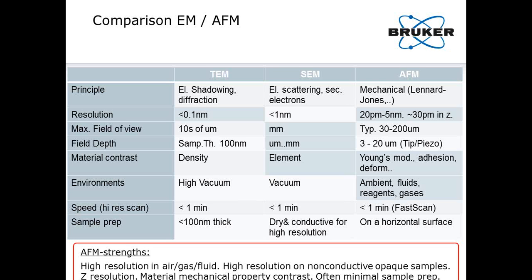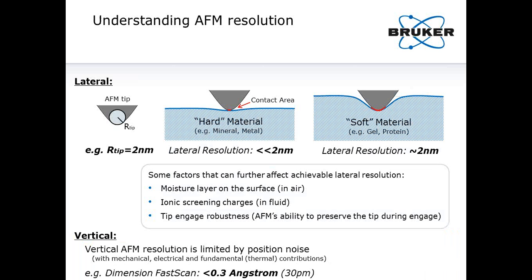One thing that will jump to the electron microscopist's attention is the huge range, over 2 orders of magnitude, of AFM lateral resolution. Milestones in EM technology were typically marked by achieving a certain resolution. Why is this not as simple for AFM? AFM vertical resolution is easy to understand. It is set by the vertical noise contributions and is an instrument characteristic.